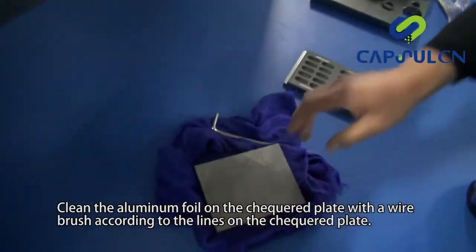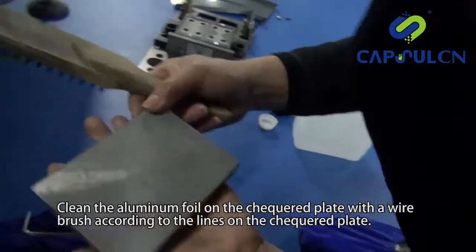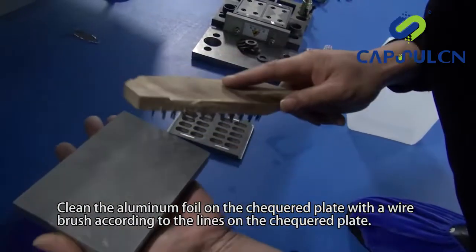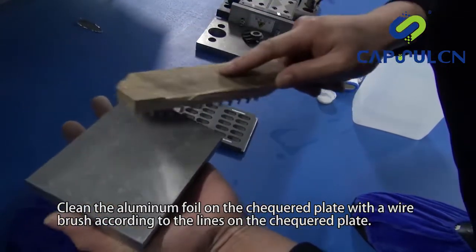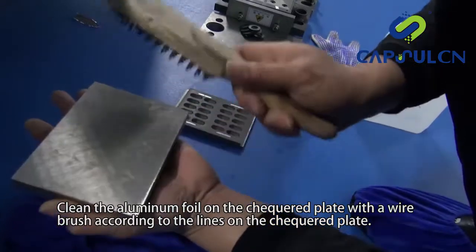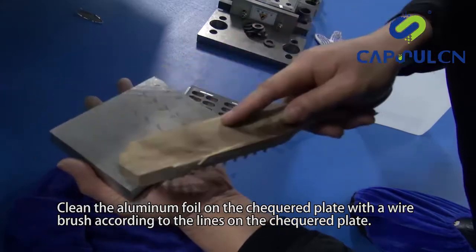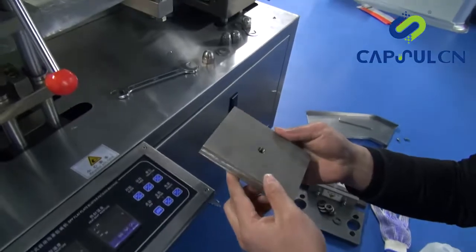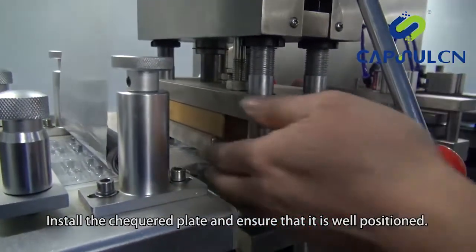Clean the aluminum foil on the checkered plate with a wire brush according to the lines on the checkered plate. Install the checkered plate and ensure that it is well positioned.